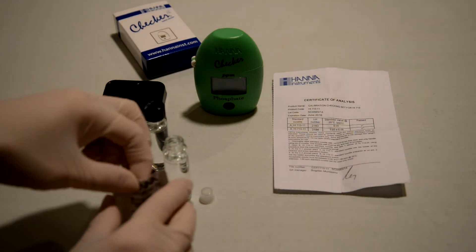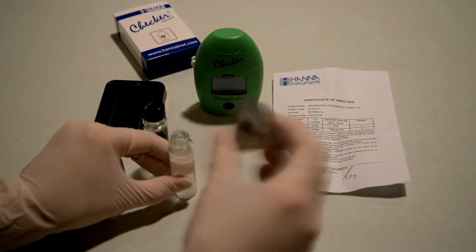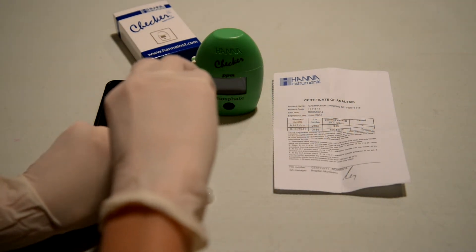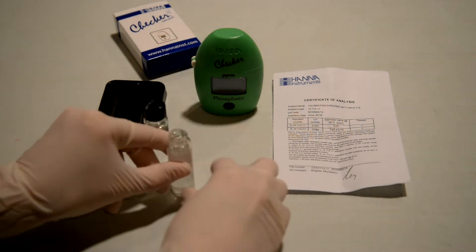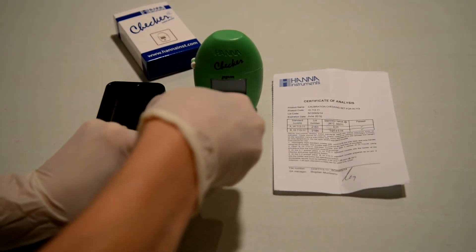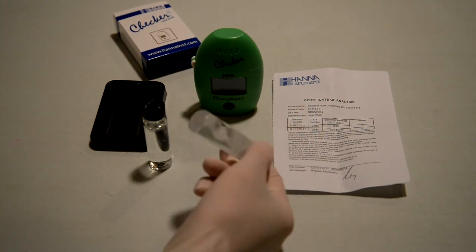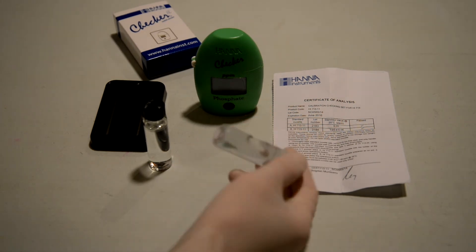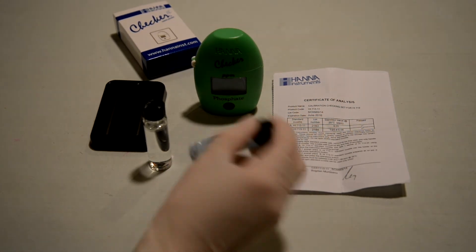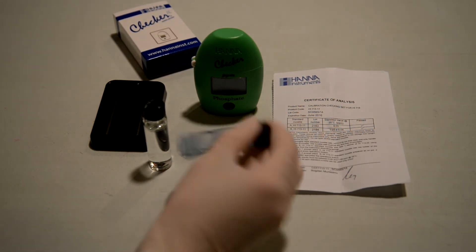One nice thing about the other three calibration kits is once you own them, you can just hang on to them — they are sealed and reusable. Even a year or two down the road, if your checker might be getting out of whack, maybe you dropped it, got water in it, or you're just not sure it's working anymore, you can always run the calibration test against it to confirm it's within spec. It's very frustrating having to use your own reagent like you do with the phosphate one.